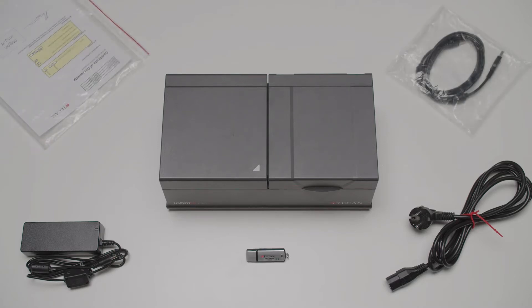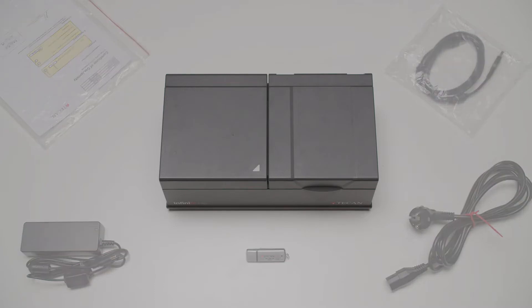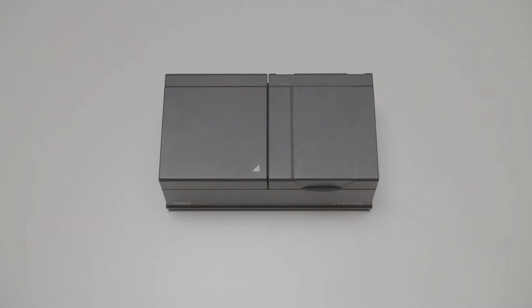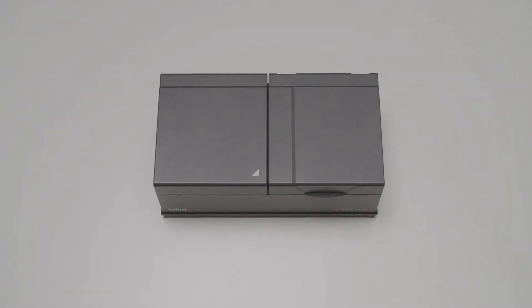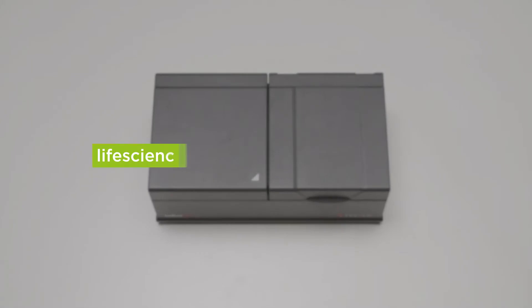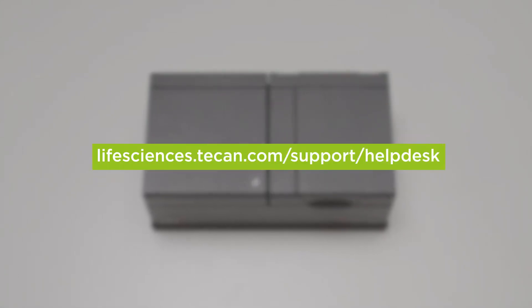The USB flash drive contains the Magellan software and more operating instructions. If you think anything is damaged, please contact our help desk.